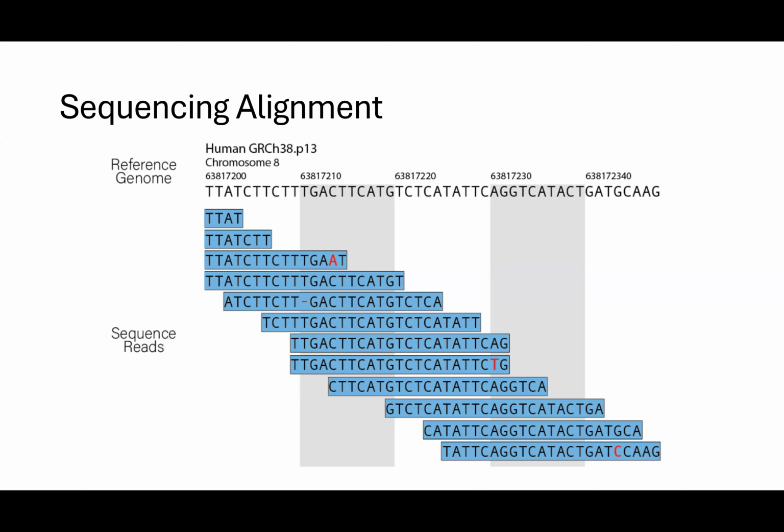Depending on what parameters you set, you can control how lenient it is, but generally sequencing isn't perfect, so we want to allow for a good deal of mismatches. If we were trying to sequence DNA for mutations or something like that, we would need a much higher read depth to accurately detect those.